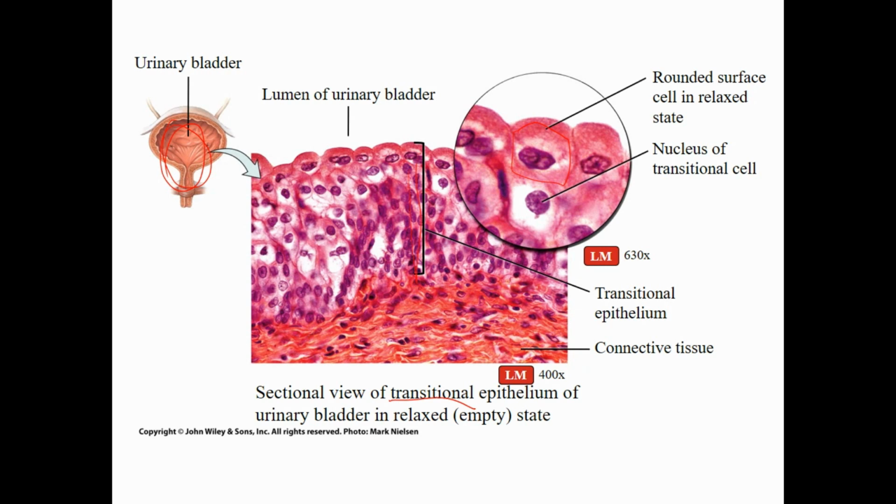The dead giveaway is, hey, we're talking about what's in the bladder. And we know the bladder, the urinary bladder, goes through great stretch. So it's going to contain transitional epithelial tissue.